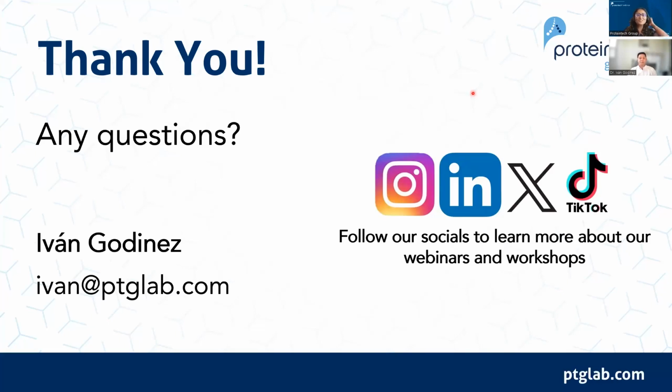Great. Our next question is asking, what number of cells do you typically recommend starting with and sequencing for the Flex kit? And does the viability cutoff not apply for this kit? I'm not sure about the viability cutoff question there, but for the number of cells that you input, you can get away with like 8,000 cells at the end that you load onto your GEM. So there's quite a bit of flexibility in the kit, right? If you're starting with 1 million cells and you end up with 200,000 or so per sample, that's more than enough to run on the Flex kit.